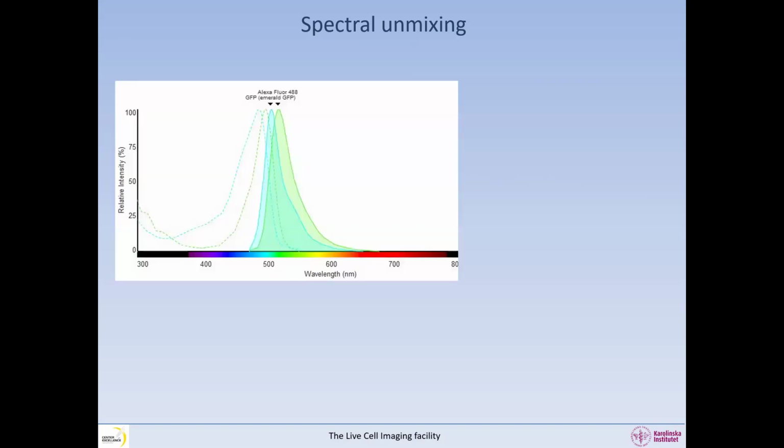This is when we would also utilize the power of the spectra by performing spectral unmixing.